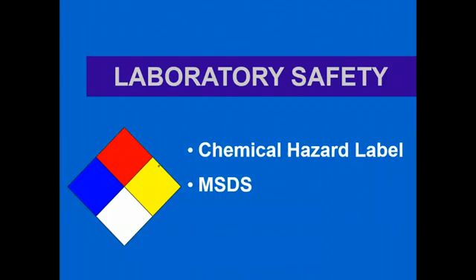This is some additional information about how to find out about chemical safety. We've already talked about lab equipment safety and behavior in the lab, but this is how you can find out information about chemicals and their dangers and how to deal with them.